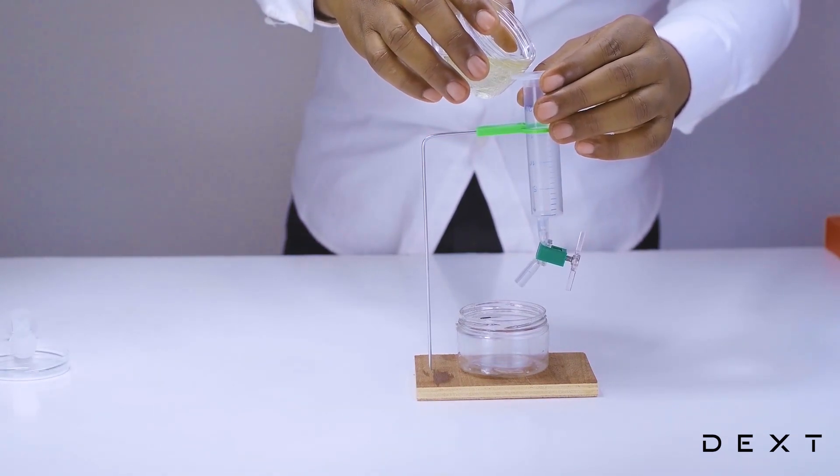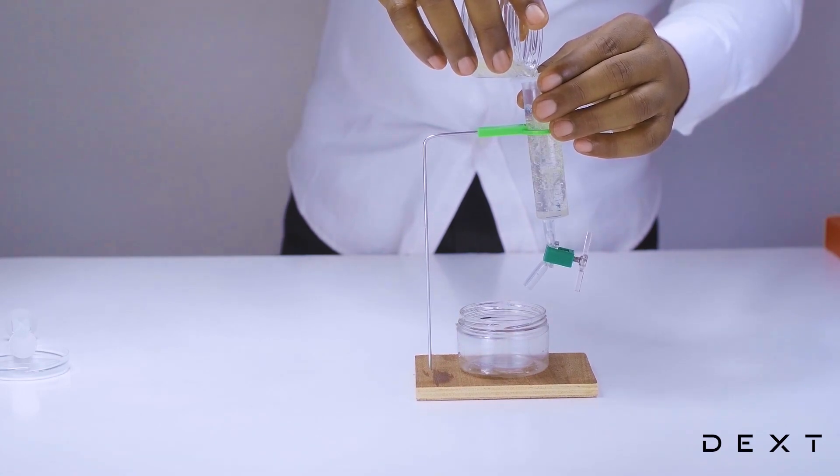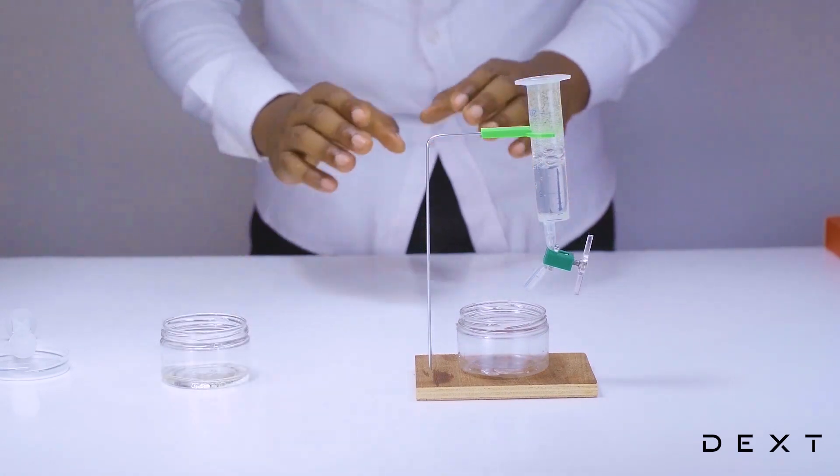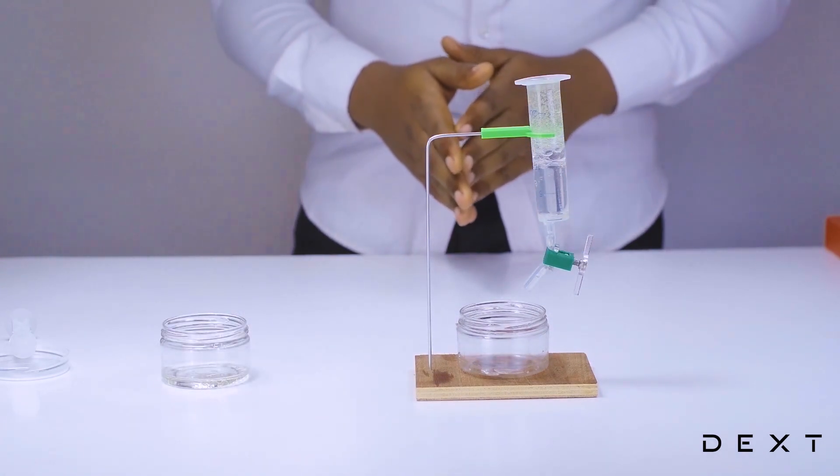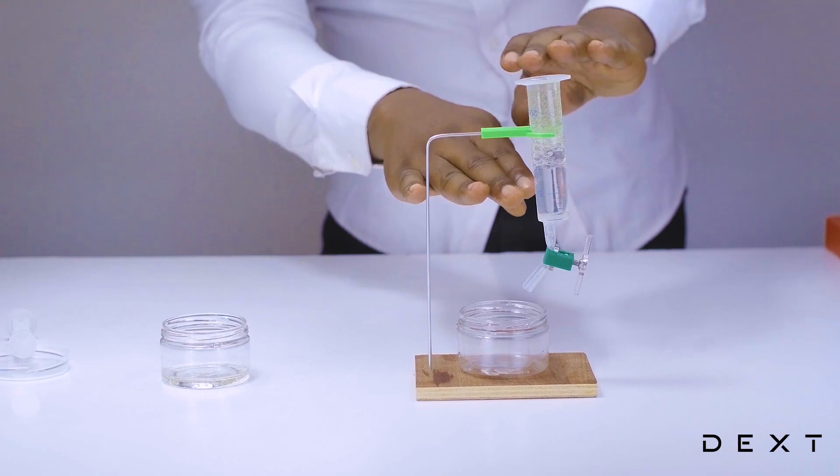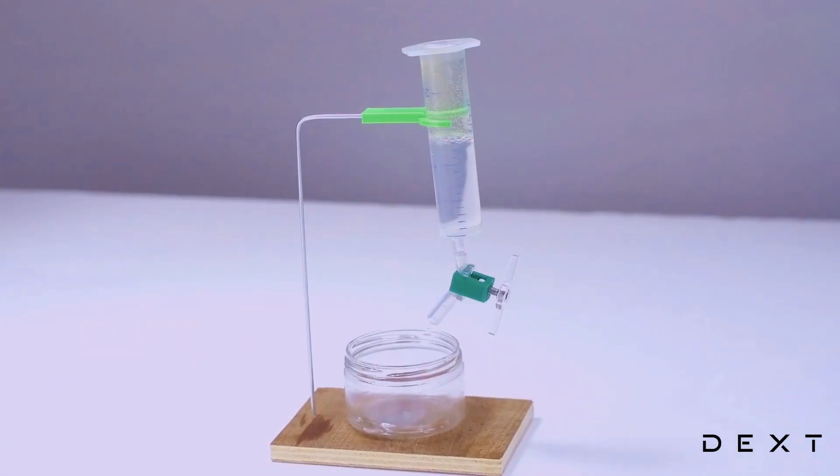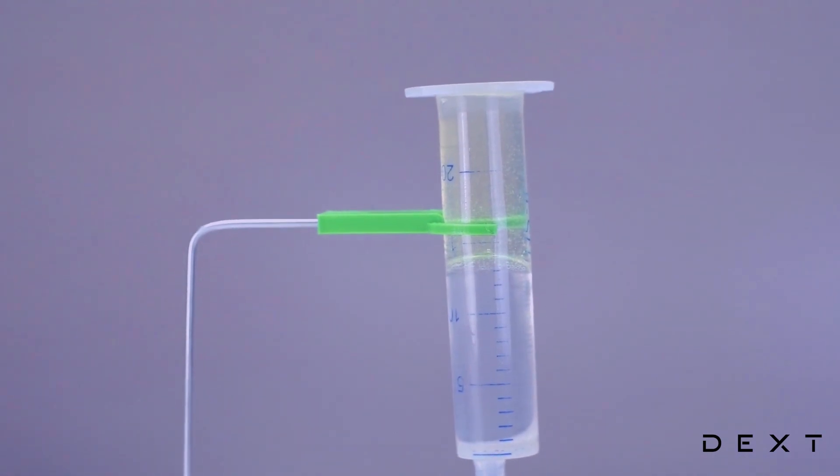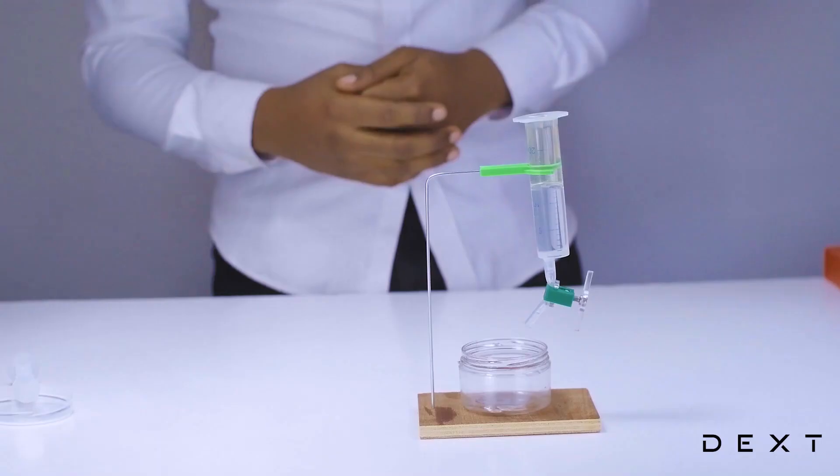Now let's pour that gently into our separating funnel. As you can already see, the mixture has begun to separate. You have the water down there and then the oil on top. You leave this for about 15 minutes so you get a nice separation.